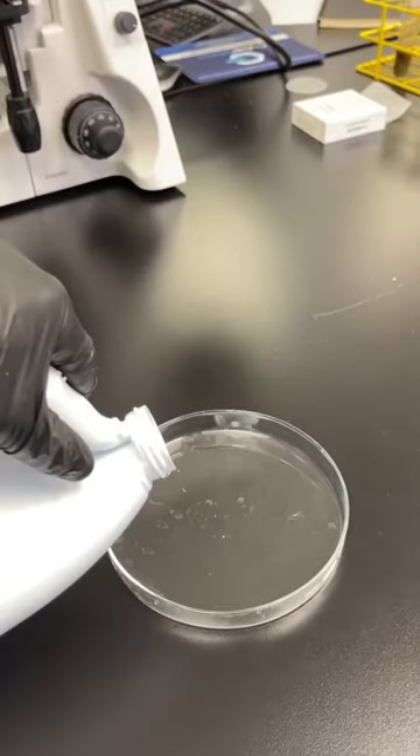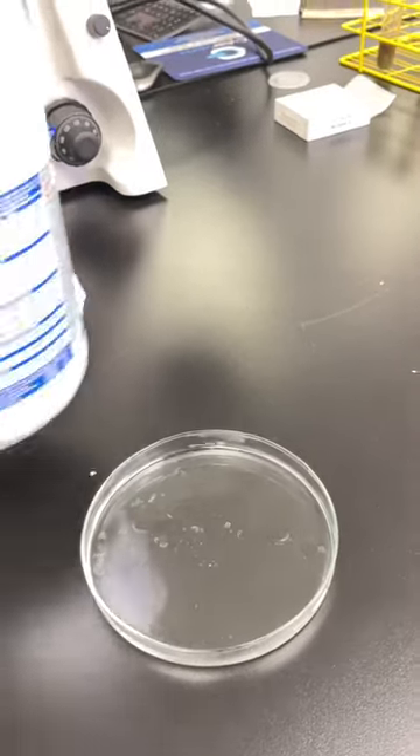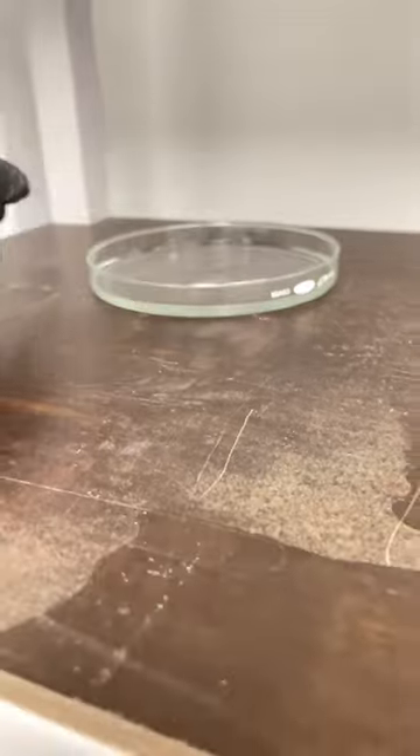Have you ever seen bleach under a microscope? Well today we'll check it out. First we have to evaporate the water from the bleach, and to do that we just leave it on a shelf for about three to four days.